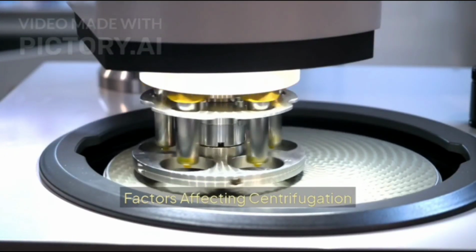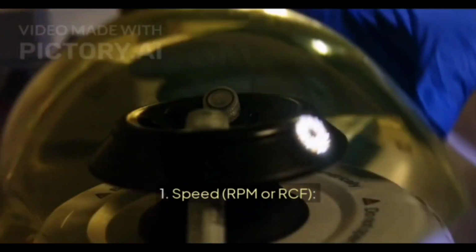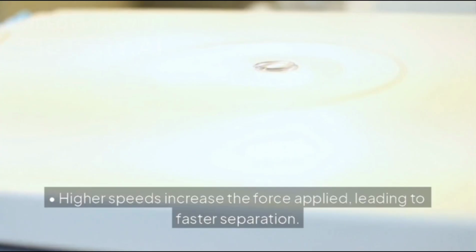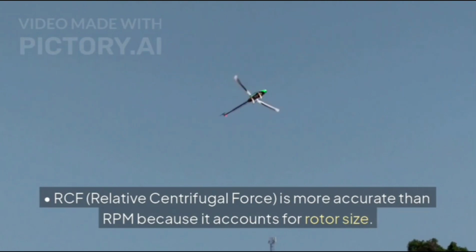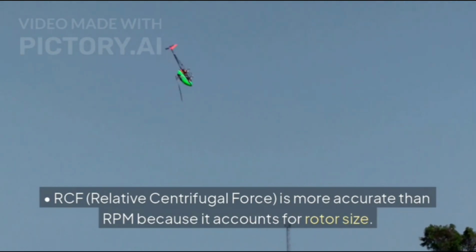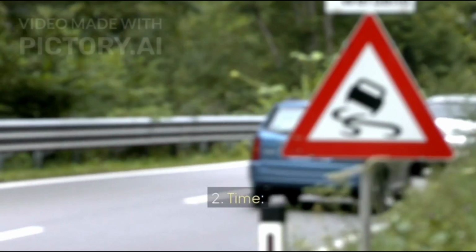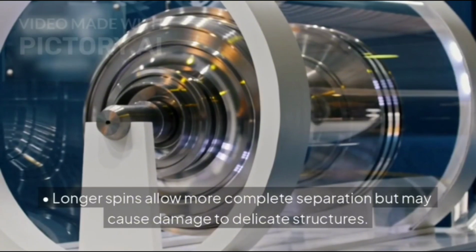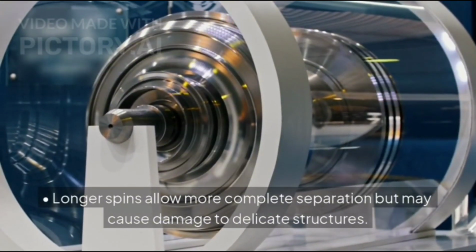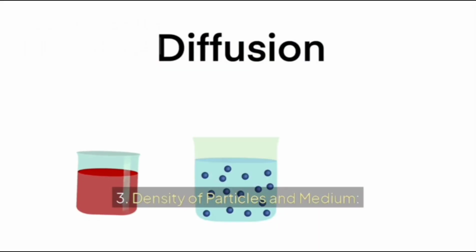Factors affecting centrifugation: speed, RPM or RCF. Higher speeds increase the force applied, leading to faster separation. RCF, relative centrifugal force, is more accurate than RPM because it accounts for rotor size. Time. Longer spins allow more complete separation but may cause damage to delicate structures.